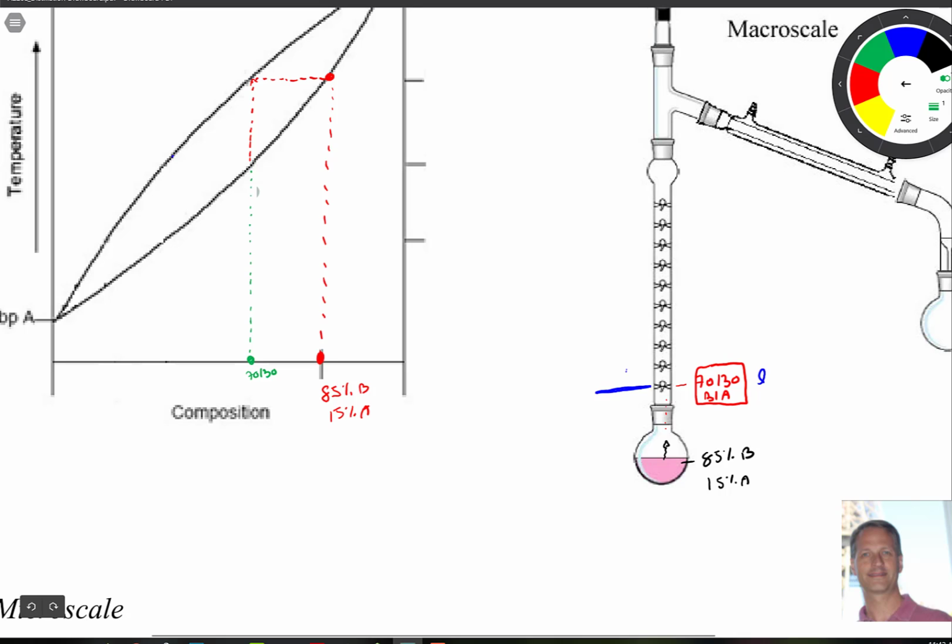What we're left with here is more vapor, right? That vapor is going to have a higher boiling point, so you have a second kind of surge of vapor coming off of this. You can think if it's continuous, but imagine that there's another burst of vapor. That vapor comes up here, right, and it's hot. It hits that liquid, and it causes that liquid that's there to turn into a gas. So we get another little distillation right there. So what happens is we kind of redistill that, but that's in the column, so we never left. We're right here.